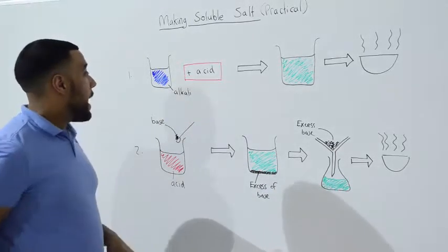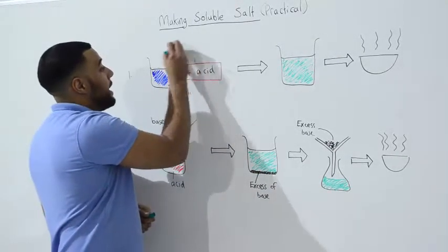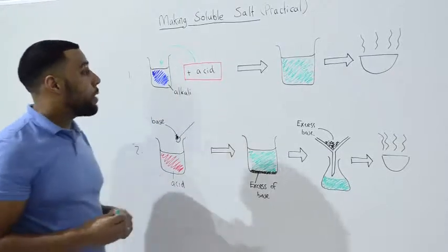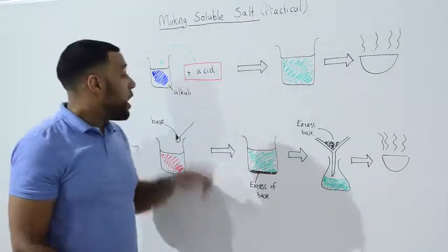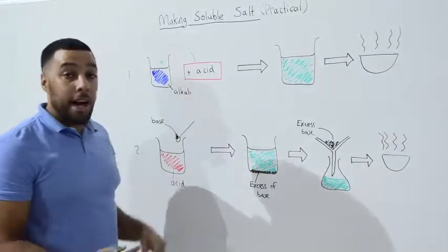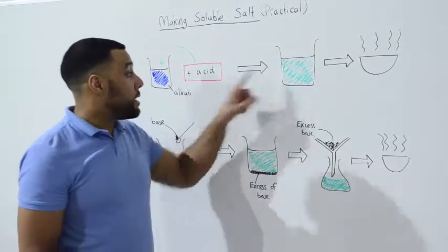We can add our acid into the alkali, and we can keep adding the acid until it has been neutralised.